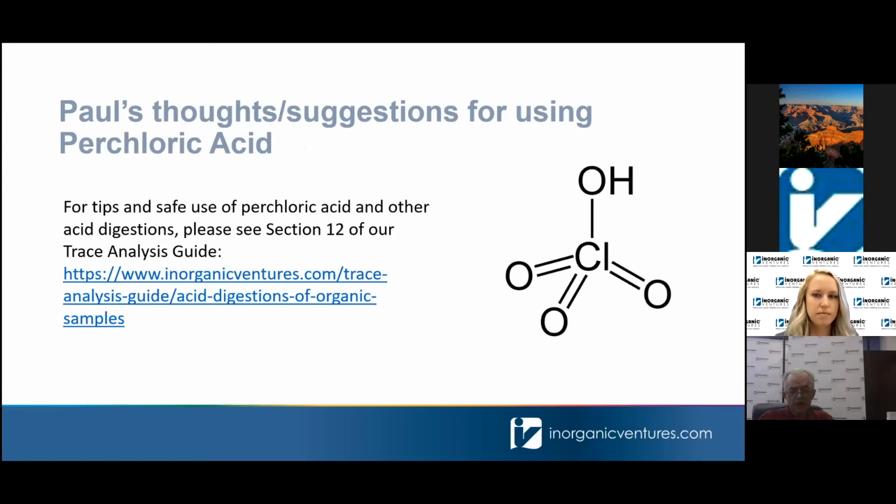Perchloric acid digestions are ones that I've had the opportunity to use now for, gosh, a long time. At Iowa State University, perchloric acid was kind of like the main acid. That's really where it started, with G. Frederick Smith and the work that he did back in those days. Perchloric acid is an extraordinary molecule, extraordinary chemistry. It can be very safe if you know how to use it.